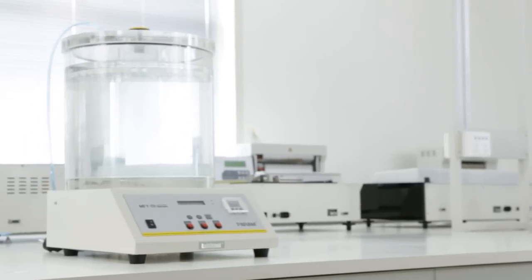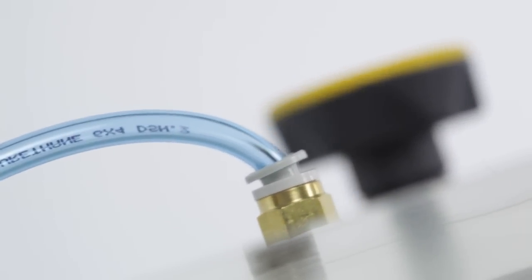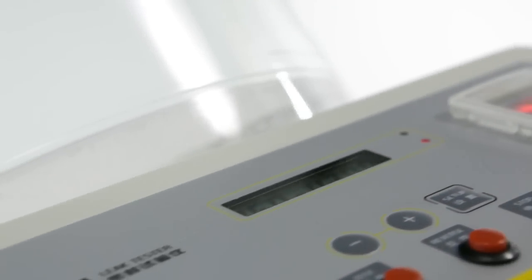MFY-01 is a leak detector that adopts the vacuum method. The detector utilizes compressed air and vacuum ejector to establish a precise degree of vacuum in the test chamber in a short time.